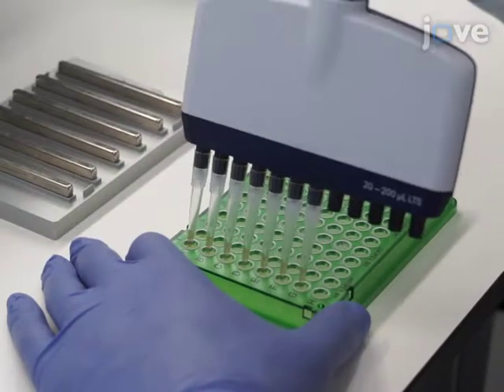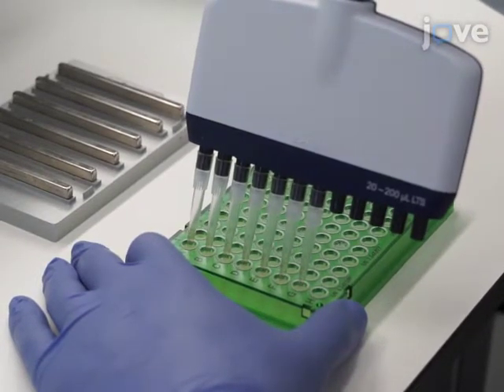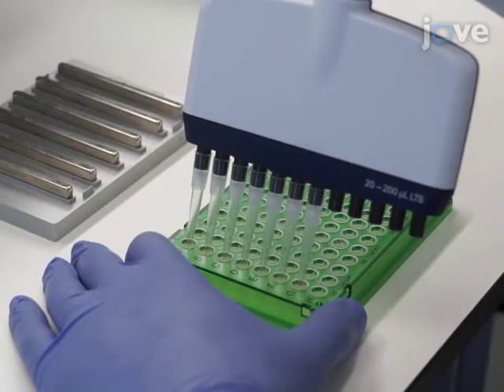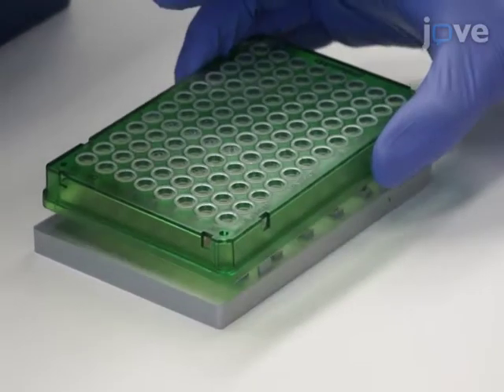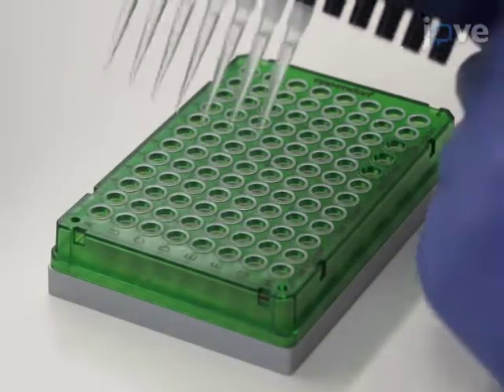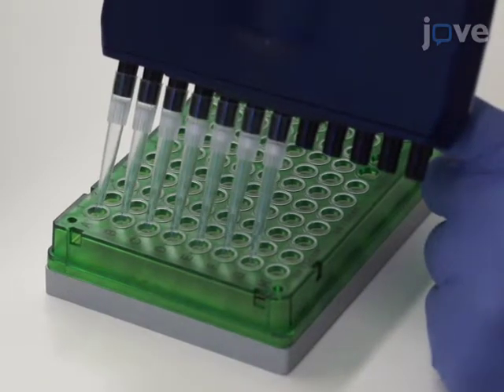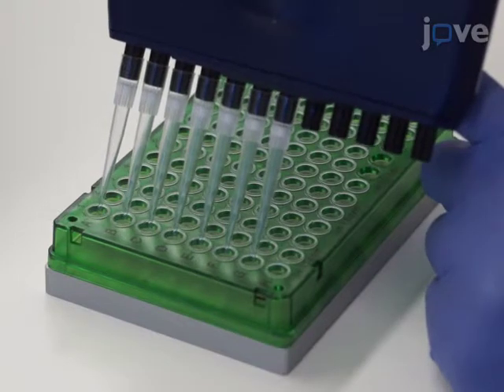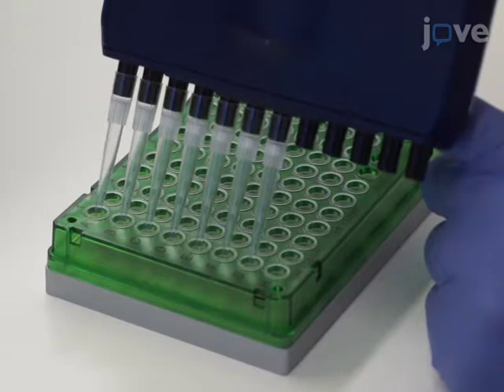Add another 25 microliters of paramagnetic beads and mix by pipetting 25 times, and incubate at room temperature off the magnet for 4 minutes. After incubating at room temperature, place the samples back on the magnet and incubate at room temperature for 4 minutes. Then discard the supernatant. While leaving the samples on the magnet, add 150 microliters of 70% ethanol and incubate at room temperature for 30 seconds without disturbing the beads. Remove the ethanol and repeat the wash.